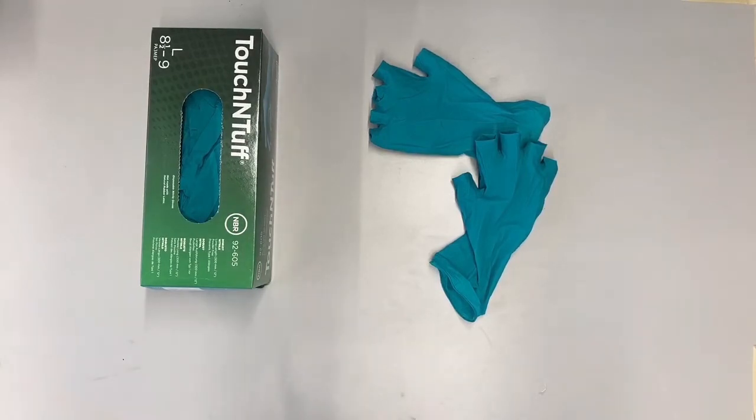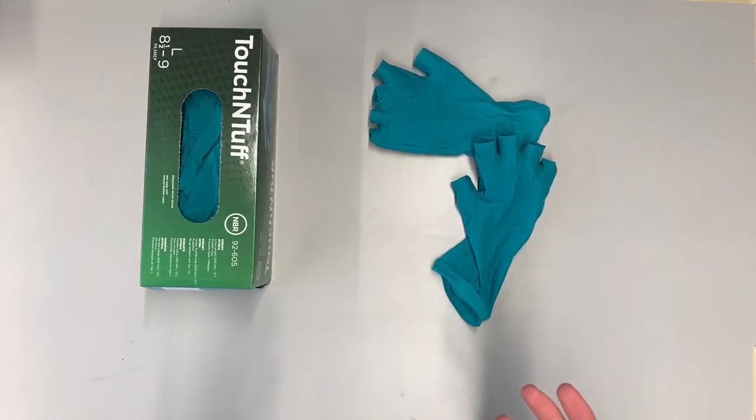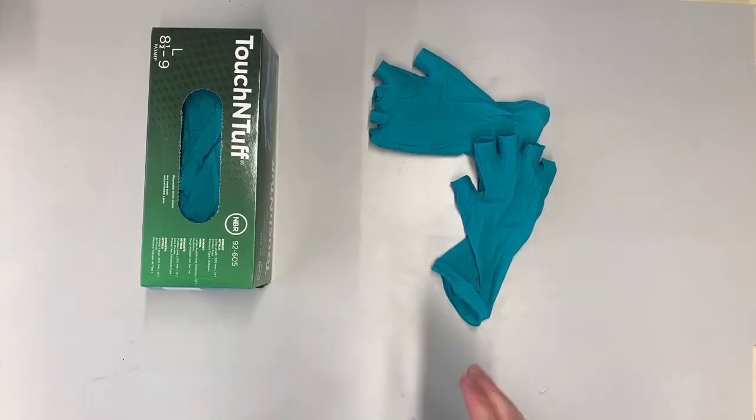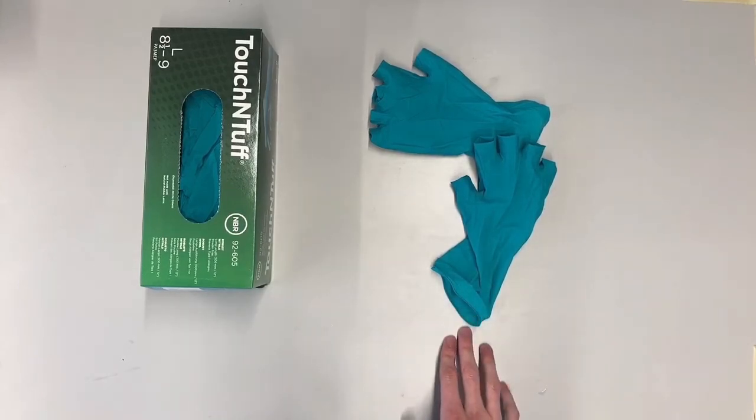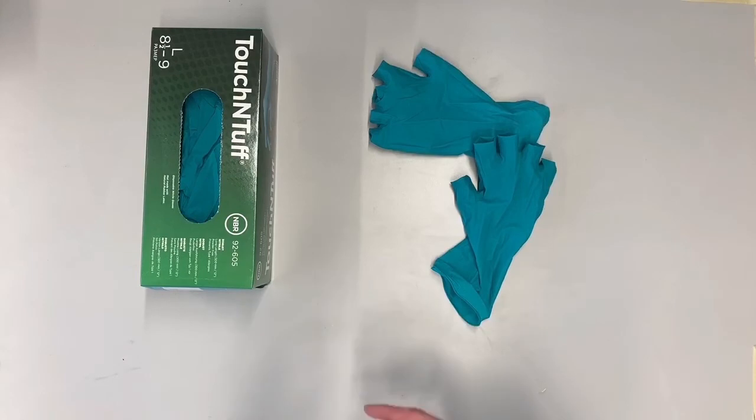So if you need to write something in your lab journal, take off your gloves. If you need to use the computer, the rotovap, or the scales, and you want to touch them, depending on the lab, you want to take off your gloves. Only put them on when working with chemicals, and think about when you want to use them and why. Remember, they will only protect you for the amount of time it takes for the chemical to go through the glove — so don't keep wearing them, do not reuse them, throw them away. This is how you use gloves.